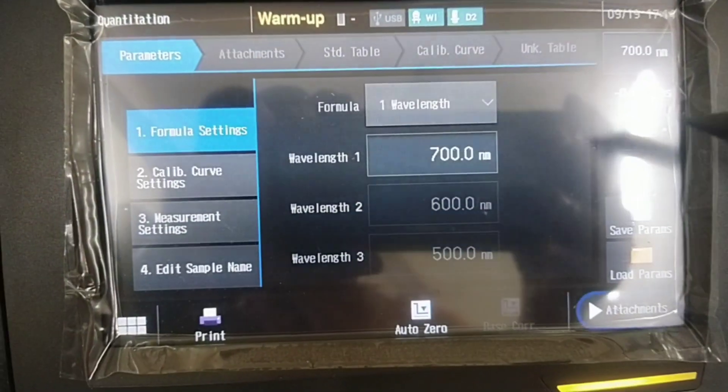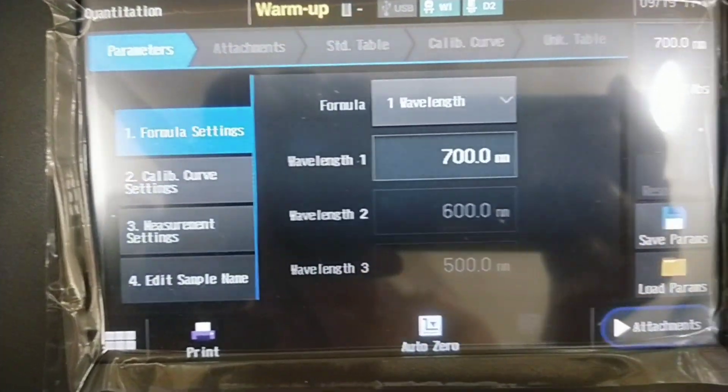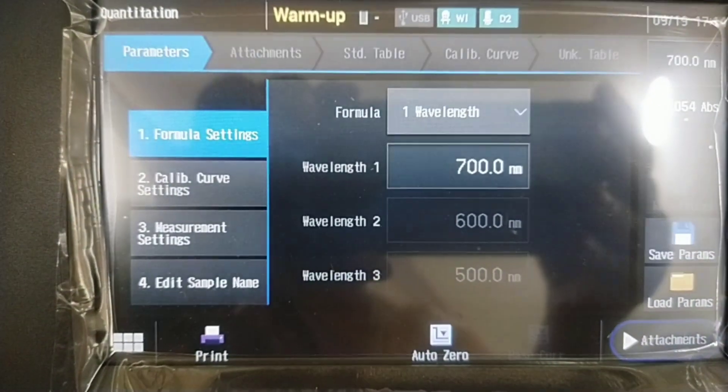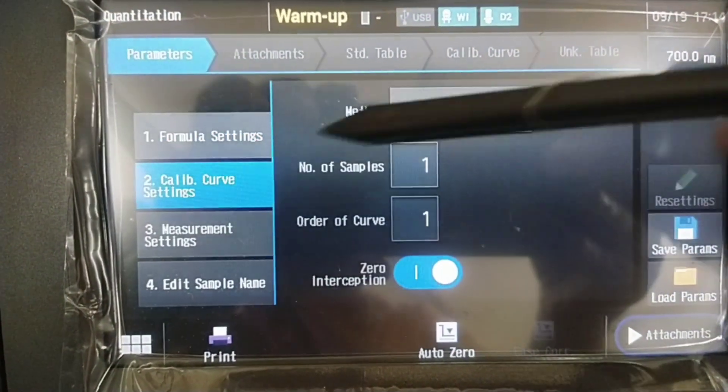Quantitation mode is used to quantify an unknown sample by creating a calibration curve from standard samples. Measurement modes include: 1 wavelength method, 2 wavelength method, 3 wavelength method, and derivative quantitation.